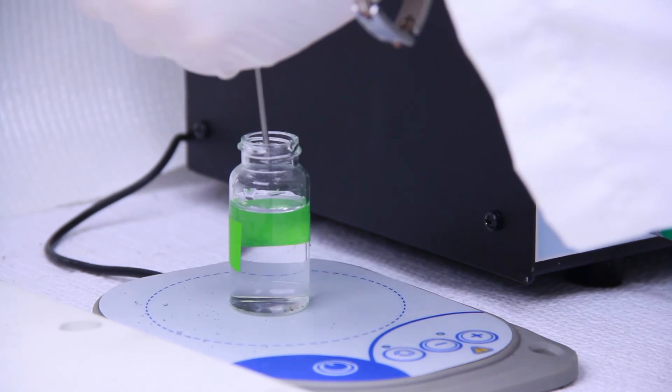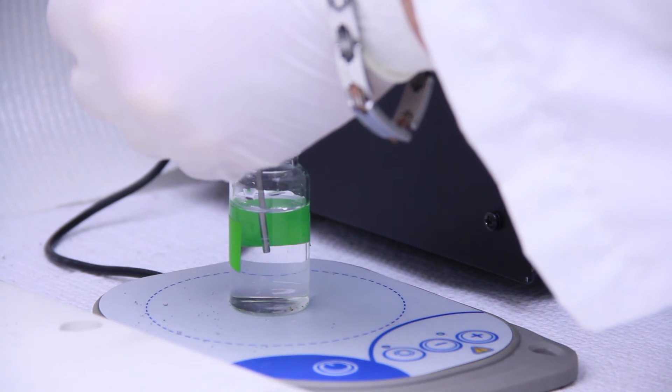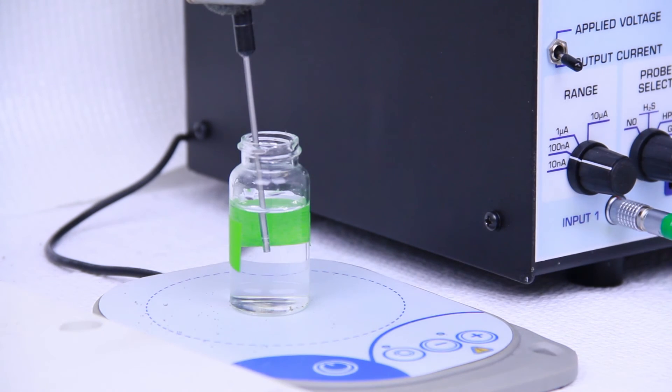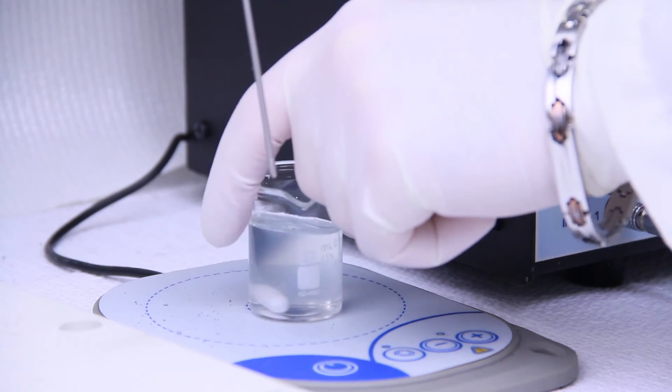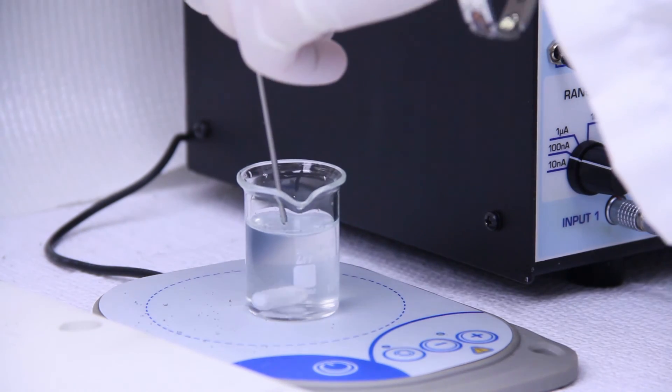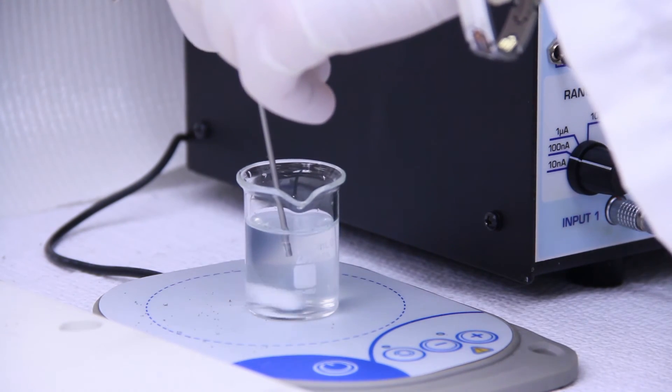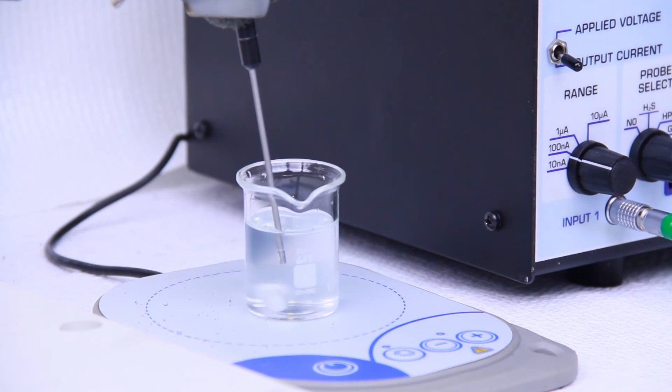Immerse the sensor in the zero percent solution and record the data for five minutes. Now, return the sensor to the 20.8% solution for five minutes and record the data. The oxygen measurements should return to the baseline value.